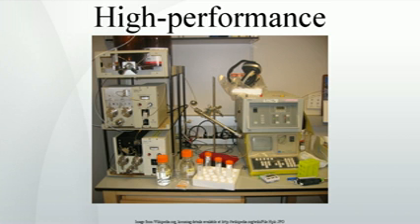RP-HPLC operates on the principle of hydrophobic interactions, which originates from the high symmetry in the dipolar water structure and plays the most important role in all processes in life science. RP-HPLC allows the measurement of these interactive forces. The binding of the analyte to the stationary phase is proportional to the contact surface area around the non-polar segment of the analyte molecule upon association with the ligand on the stationary phase.